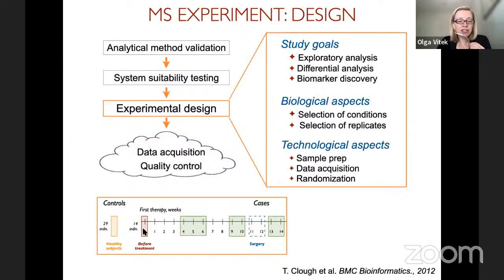You could ask questions: which proteins change in abundance between healthy and disease at diagnosis? Which proteins become more similar to healthy levels after the treatment? Which proteins change primarily after surgery? This is the type of experimental design, the type of questions that MSstats can answer. And again, it requires fairly specialized statistical models to reflect different sources of variation.